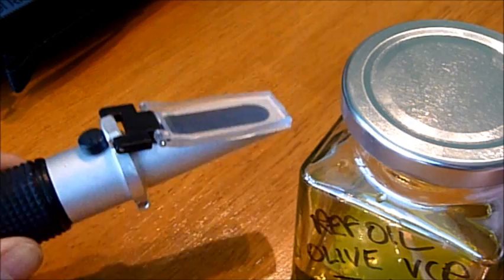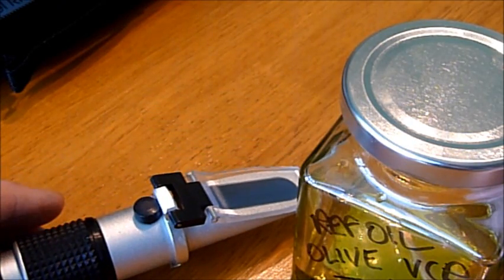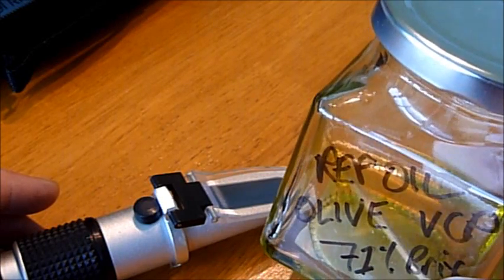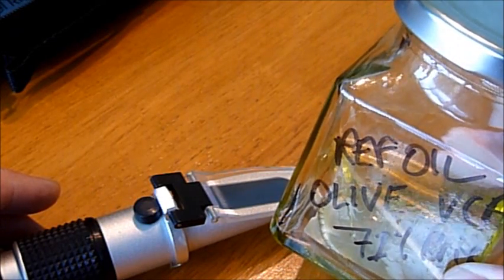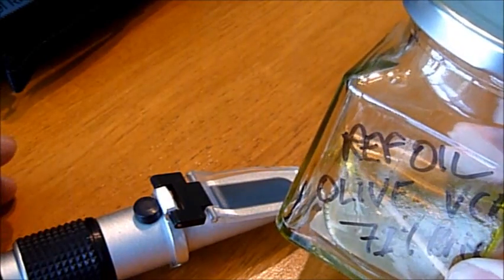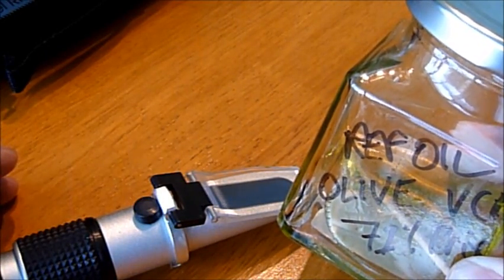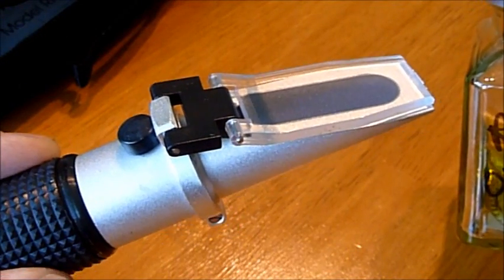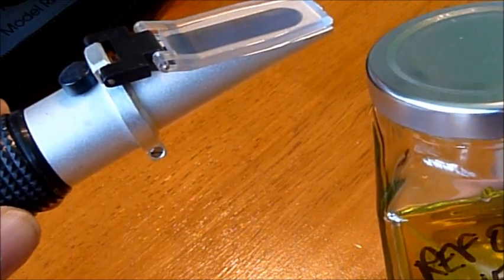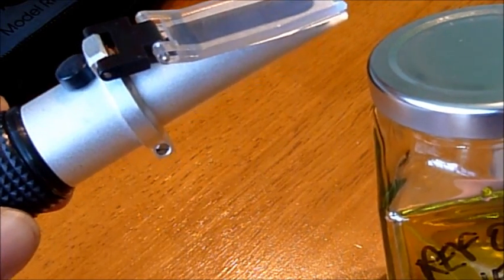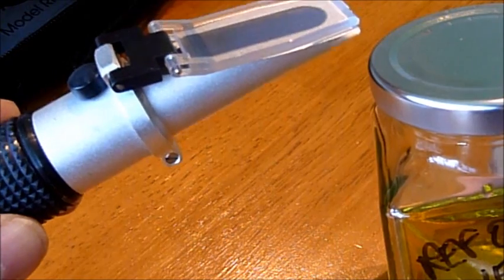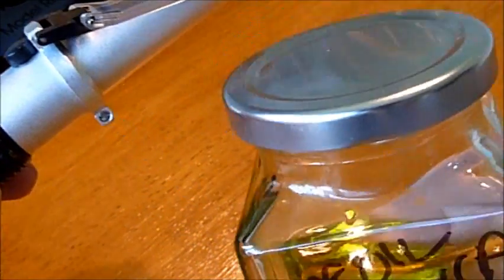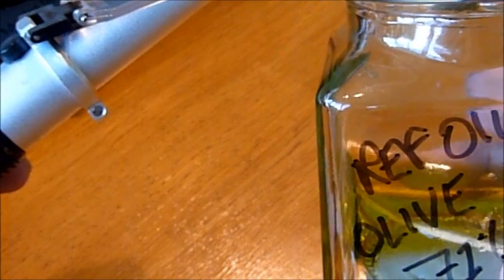When I bought this refractometer the first thing I did was to decant some olive oil that we happen to have in the kitchen. As it happens cold pressed virgin olive oil has a refractive index of somewhere between 71 and 72 depending on the exact composition of the oil. By checking the reading of the refractometer as soon as I bought it against a known reference point of the olive oil that won't change, I've now got a point at which I can calibrate back to should I need to. In other words the refractometer may change in terms of its settings but the olive oil won't change in terms of its refractive index.